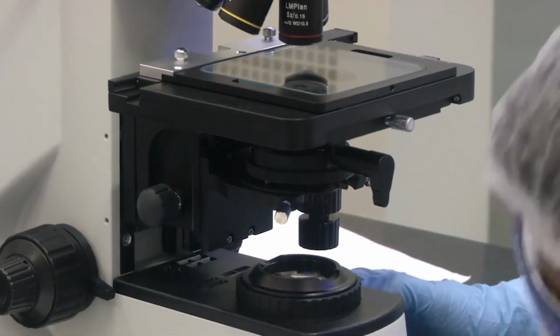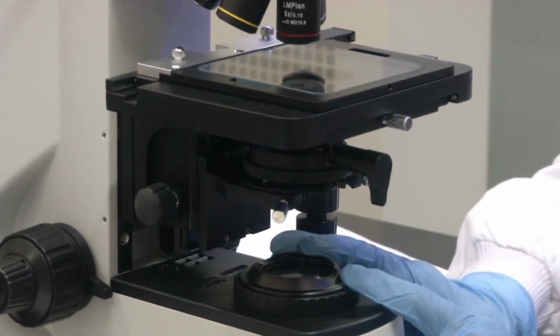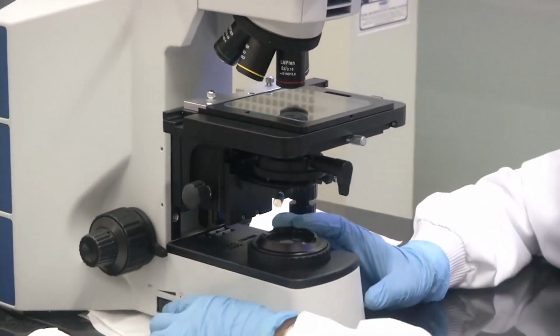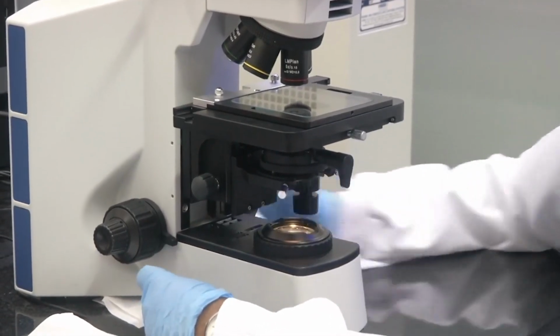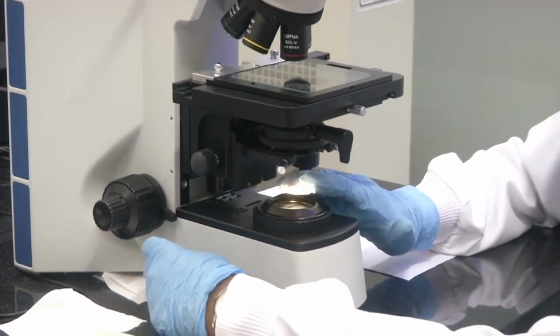Now let me get into the basic knobs first. As I showed you before, this is the bottom light source. Here you see a switch. This is for switching on the bottom light source. Let me switch it on. It is just a rotation. I rotate it and the light source comes into picture. I think you can see the light. See, my hands are glowing. Let me switch it off now.